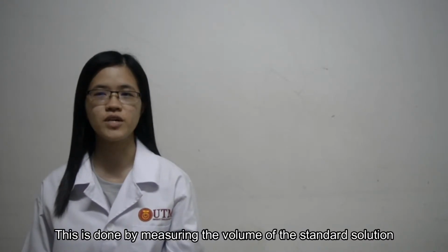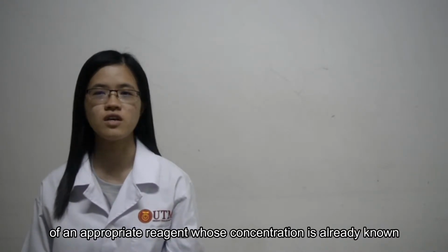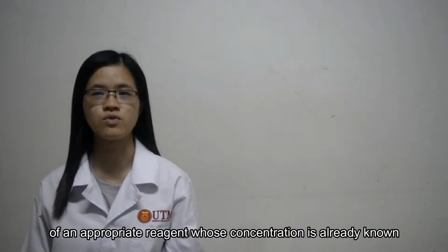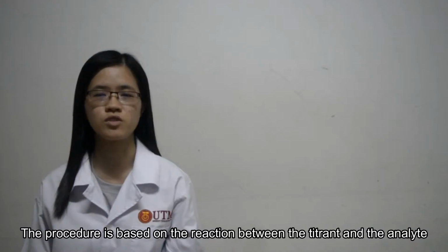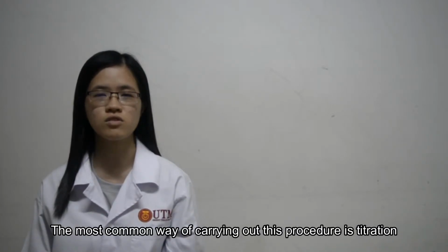Volumetric analysis is an analytical method to find out the volume or concentration of an analyte in a solution. This is done by measuring the volume of a standard solution of an appropriate reagent whose concentration is already known. The procedure is based on the reaction between the titrant and the analyte. The most common way of carrying out this procedure is titration.